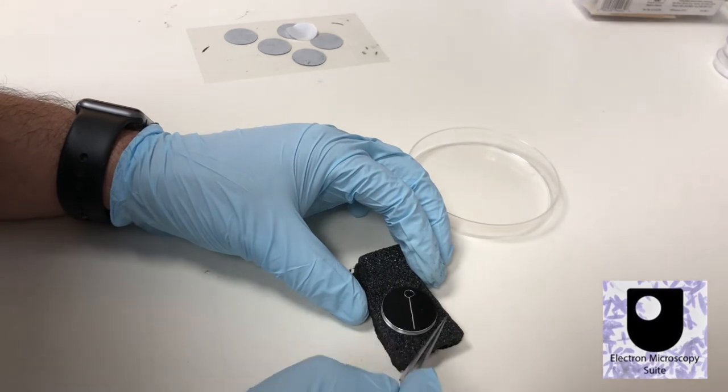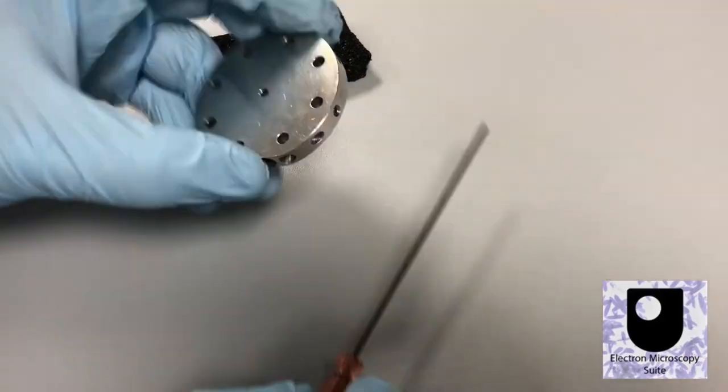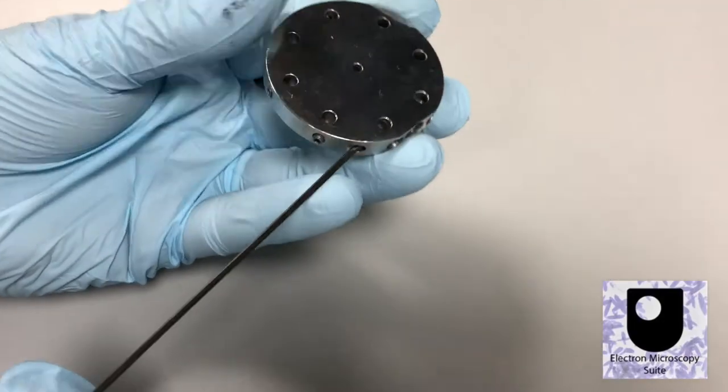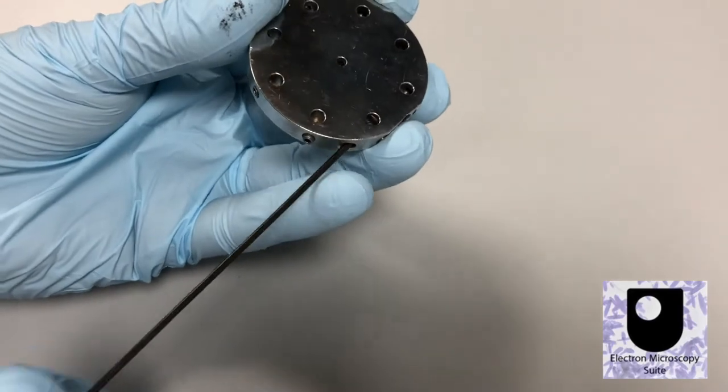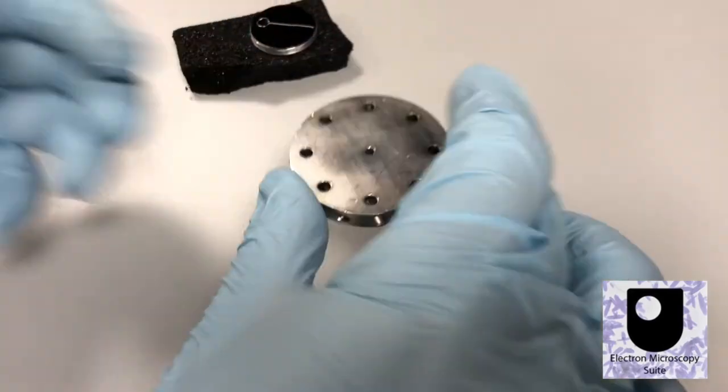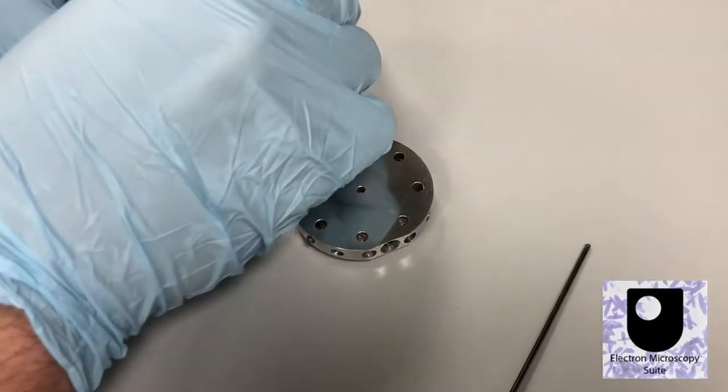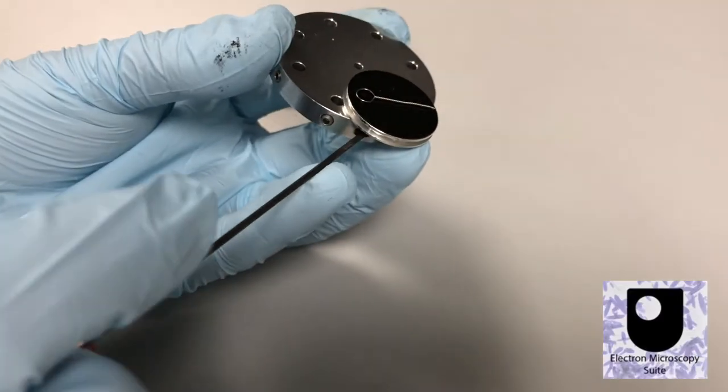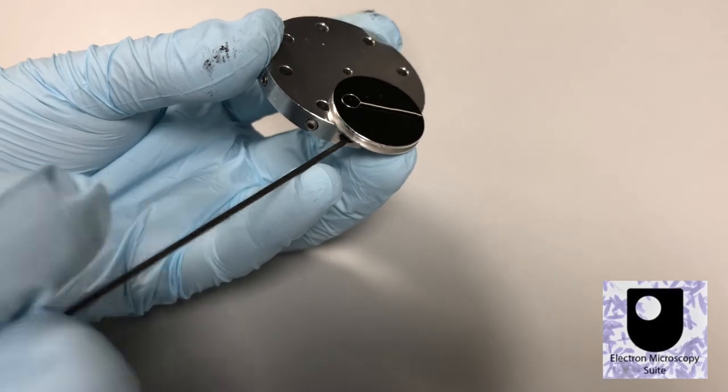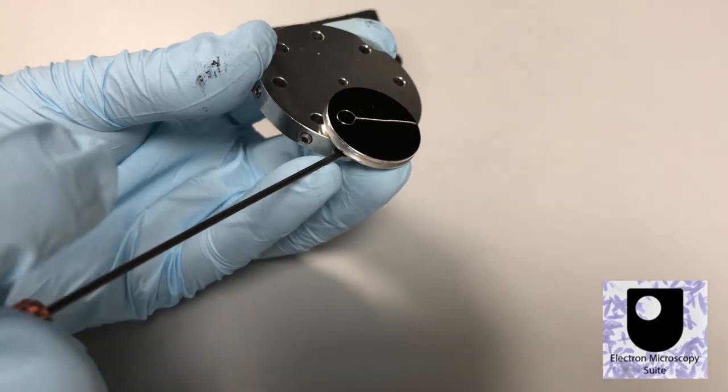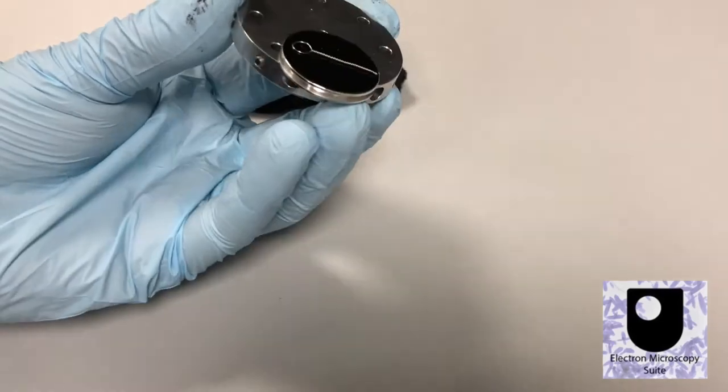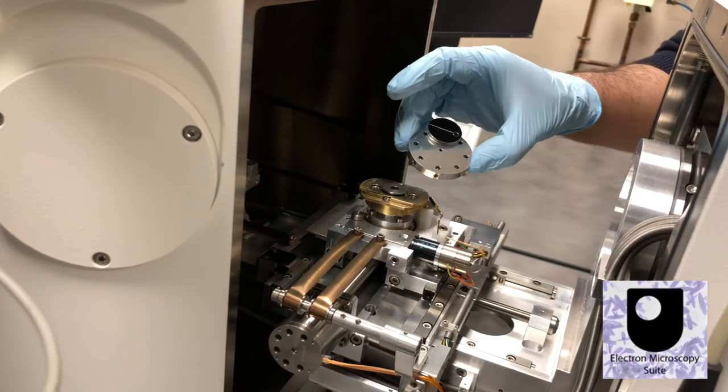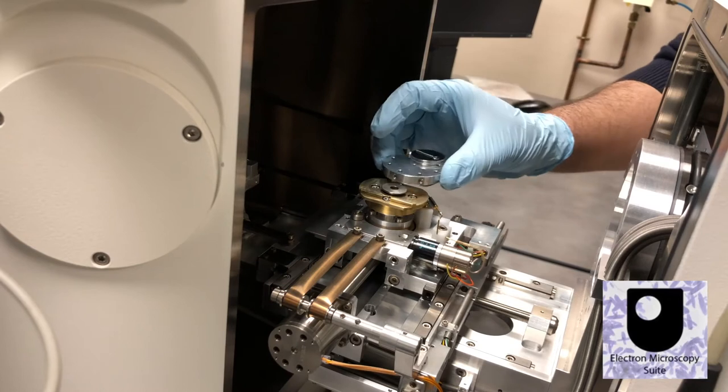Electrostatic charging of a sample is detrimental to image quality. The substrate is fixed firmly to the sample holder, which is then attached to the motorized analysis stage. This prevents unwanted movement of the sample during navigation.